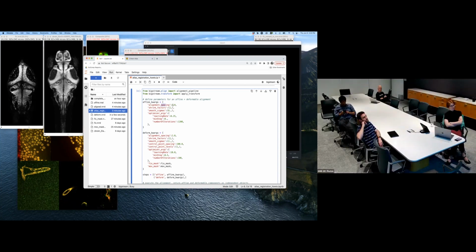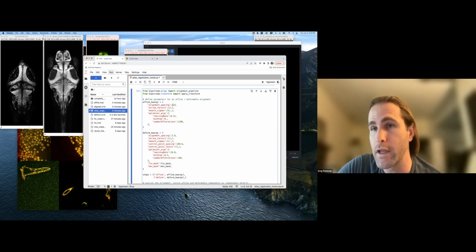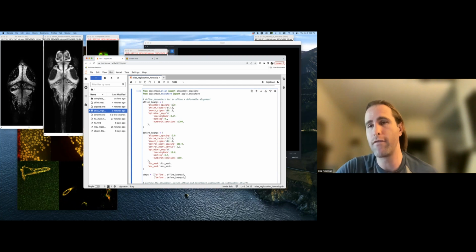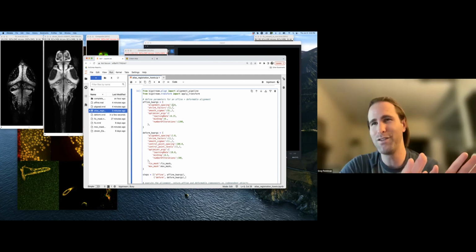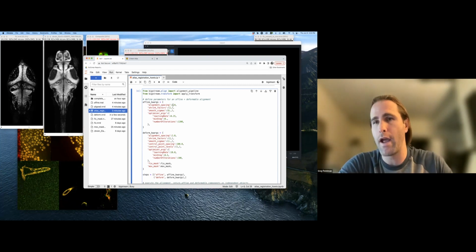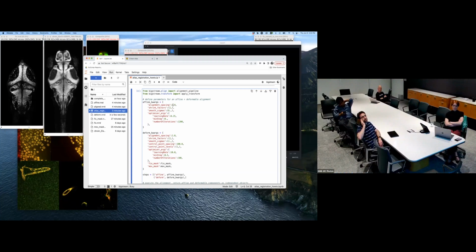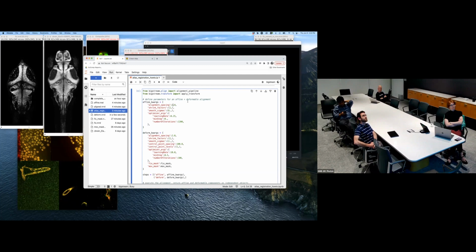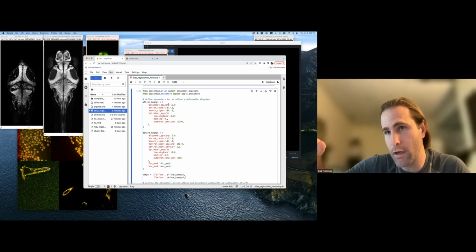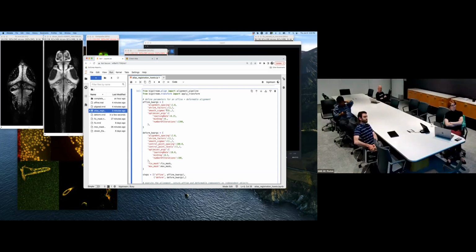Often it's better to make these big values and throw out more data, especially early. Usually you want your first few steps in alignment to be really simple, like just put the two shapes on top of each other. And once you feel confident you're doing that, then you gradually refine. The real guiding principle for successful automated alignment is coarse to fine, both in image resolution and in image features. These downsampling parameters give you coarse resolution, and the smoothing gives you coarse features. It blurs out little noise patterns or small objects that might trip the algorithm up. And then finally, the optimizer arguments.